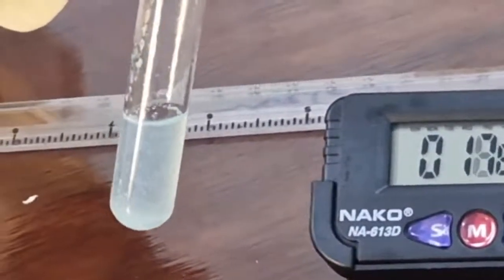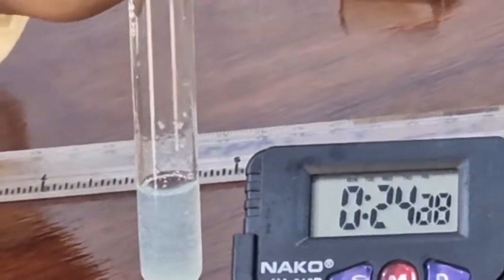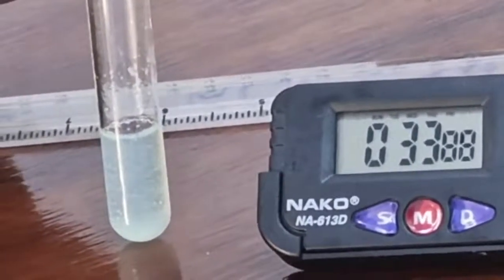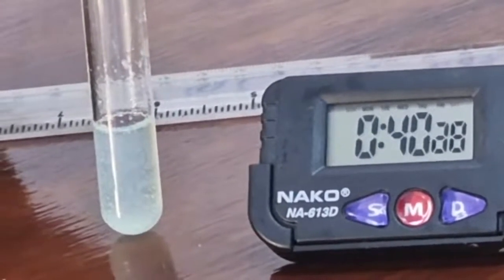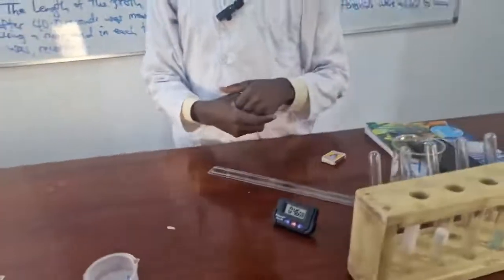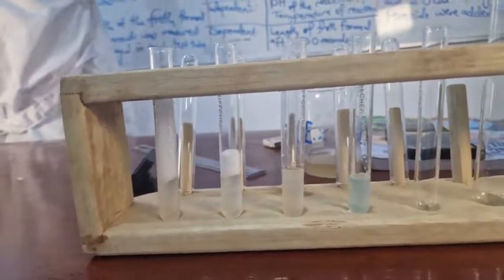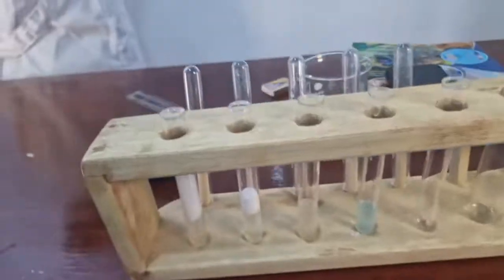So the bubbles in 40 seconds. I think after 40 seconds, same issue with D as with C. With D, again 0.0 centimeters.